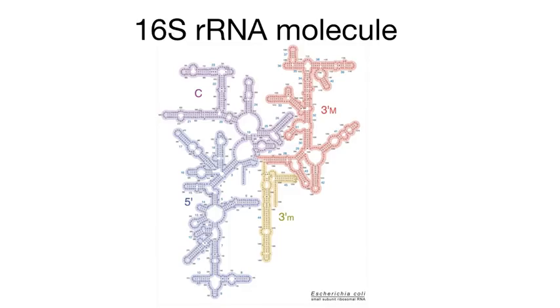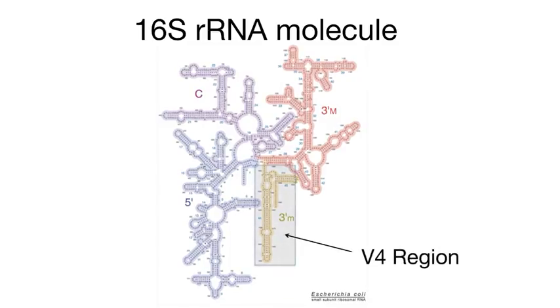The 16S rRNA gene is found in all bacteria and archaea, and only in bacteria and archaea. Humans don't have this gene. The 16S rRNA gene is approximately 1,500 nucleotides long. However, like most genes, it contains regions of conserved and variable sequence, some of which are more variable than others. We use the more conserved regions to pinpoint the gene, and we use the variable regions to tell species apart. Up until now, it appears that the V4 region is one of the best regions for telling different types of bacteria and archaea apart. So most microbial analyses target this part of the 16S rRNA gene.